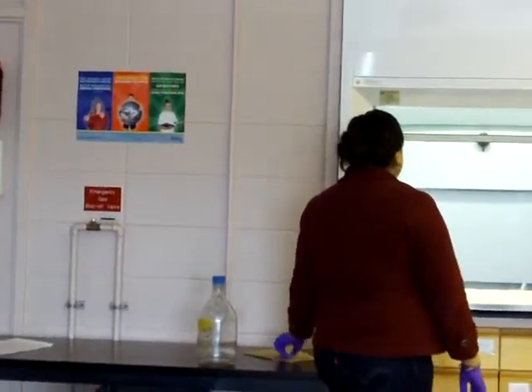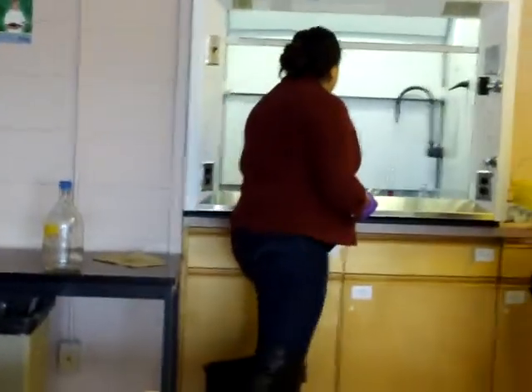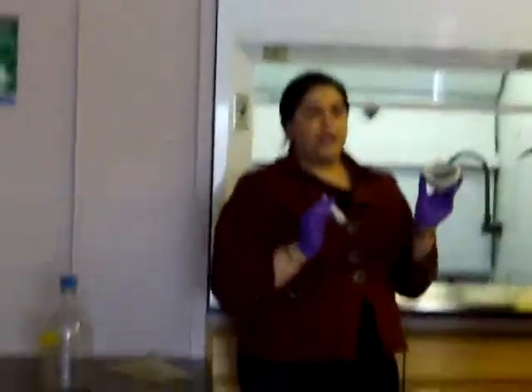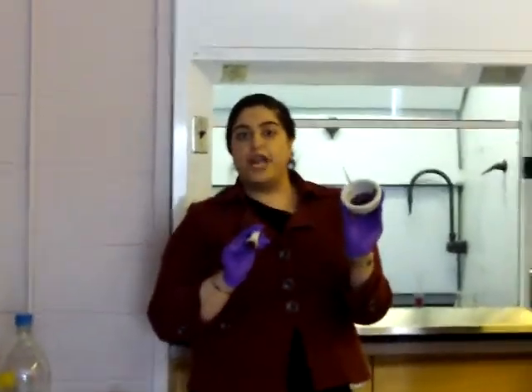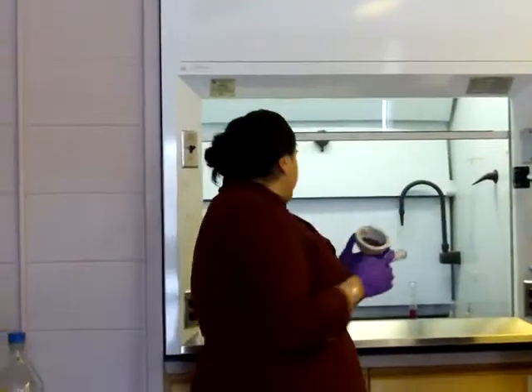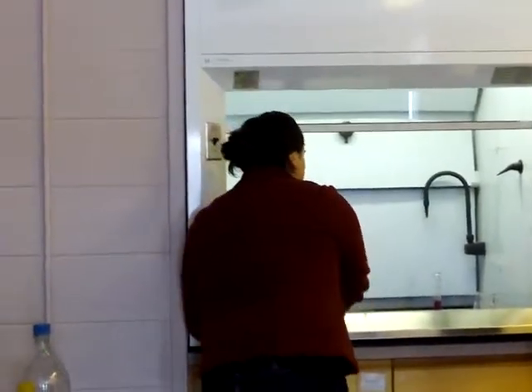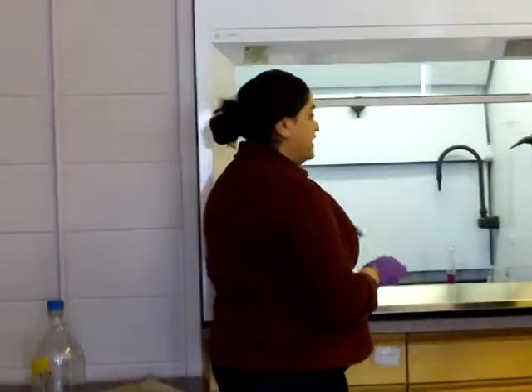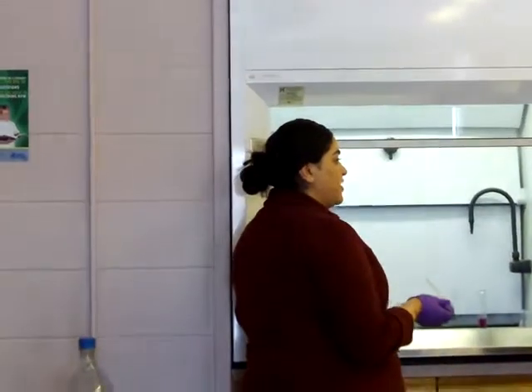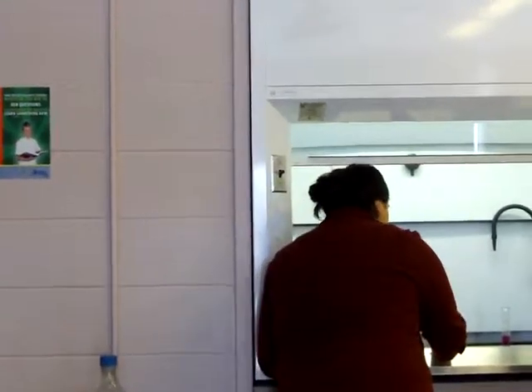The first one I'm going to do, I have prepared 3 times in case it doesn't work. It didn't work the first time because I didn't grind it up. By grinding the potassium permanganate up, I created more surface area. Then I found that if I dumped it in and used a metal scoop to make a little indentation, the potassium permanganate will absorb the glycerine and you should see the reaction, hopefully.